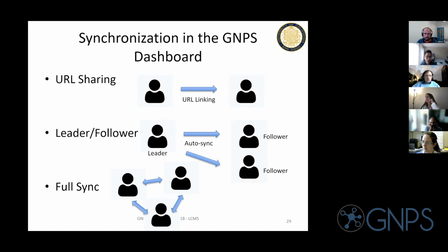My analogy, at least for those of us familiar, is if you use Google Docs or Office 365, you might do some editing of a document and everybody else is viewing the document, right? So they see all the results immediately. Where we think this is interesting, especially for a classroom, is you might get the students started, showing them the ropes, and you take them halfway there. And then at that point, these followers, your students, stop following you and take that particular visualization and build on that.